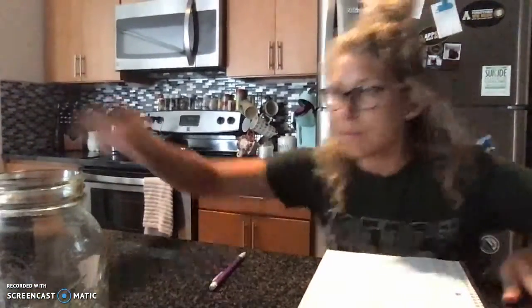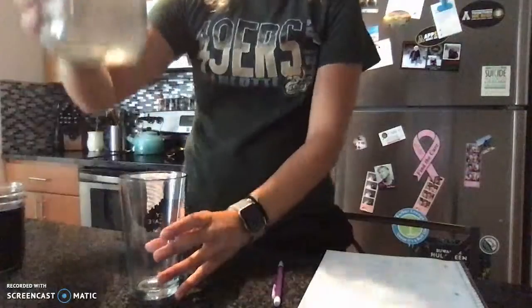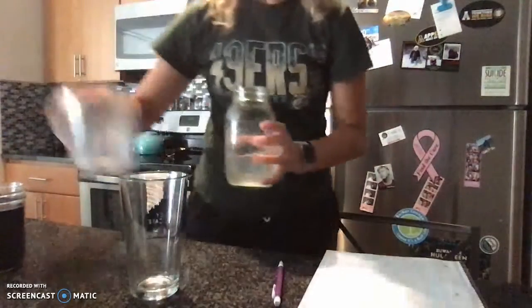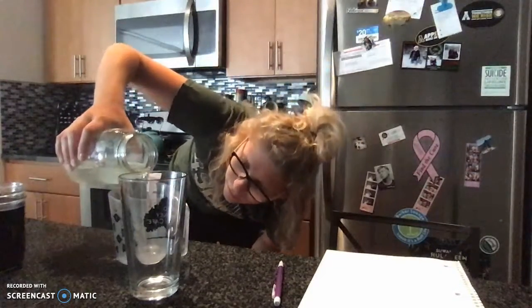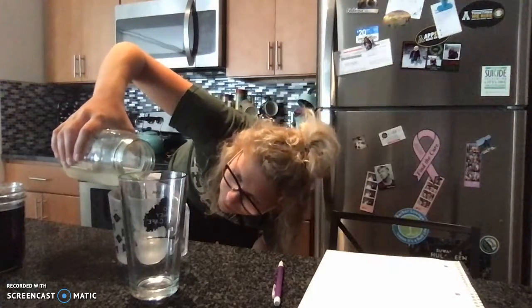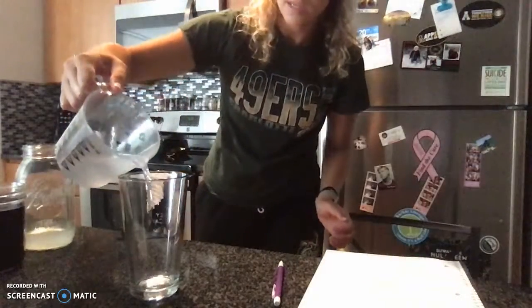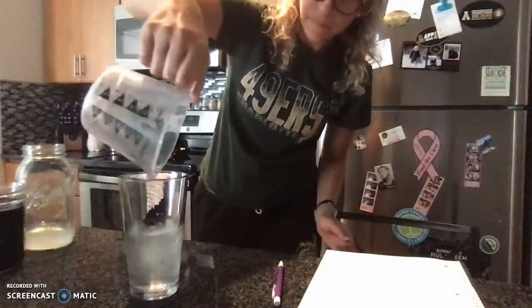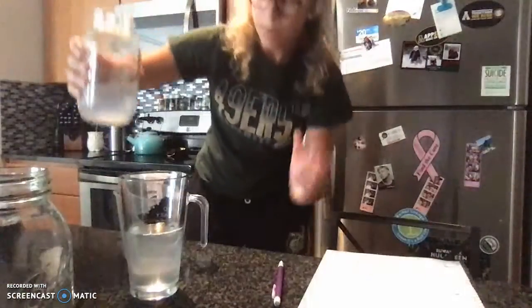So I have some leftovers of the solution. I'm going to go ahead and do this one more time so we can see the reaction change. I'm going to take equal parts of solution A and put it in the cup. And then equal parts of solution B.